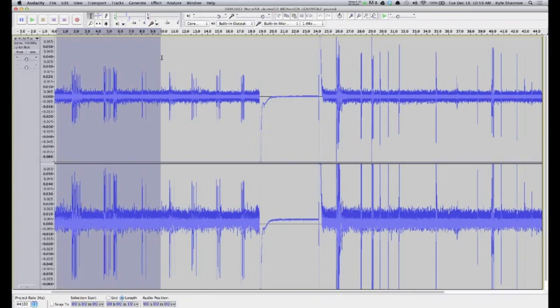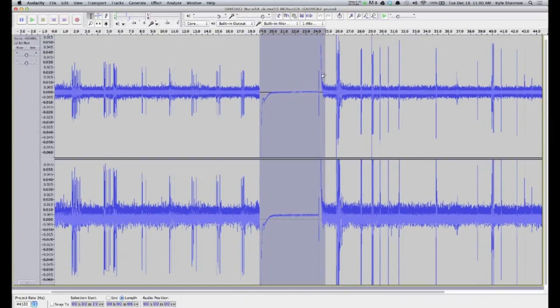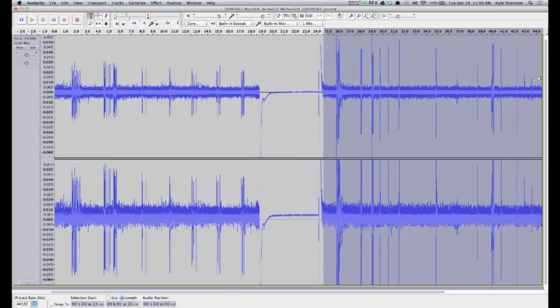Here's the Audacity recording we just took. The first group of spikes highlighted are your posterior lateral giant fiber recordings. The lateral fiber receives sensory information from the posterior end of the worm. This middle flatline area is where you turn off the spiker box. This was done to create an easily recognizable area that separates your posterior and anterior data. This last group of spikes highlighted are your anterior medial giant fiber recordings. The medial fiber receives sensory information from the anterior end of the worm.